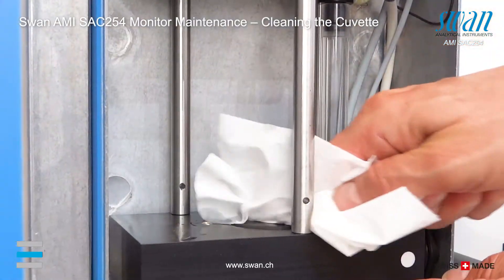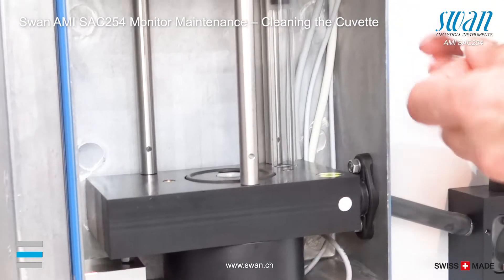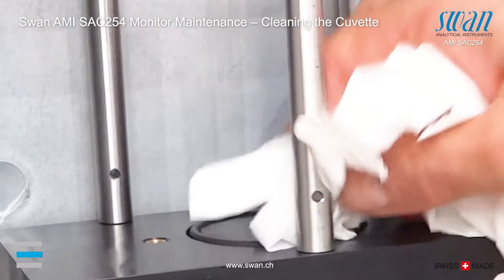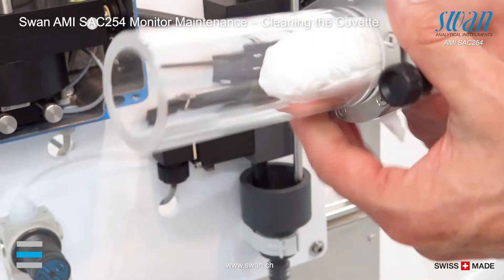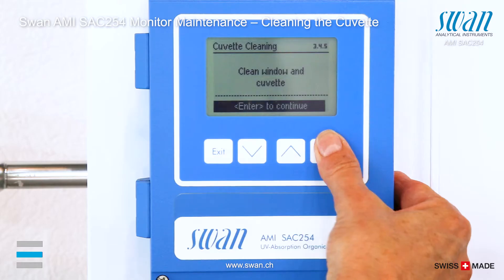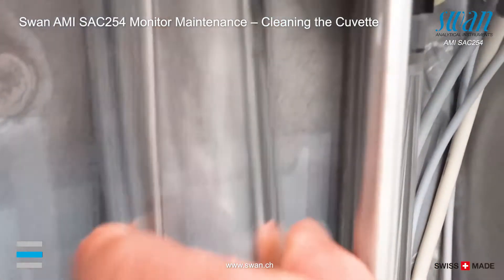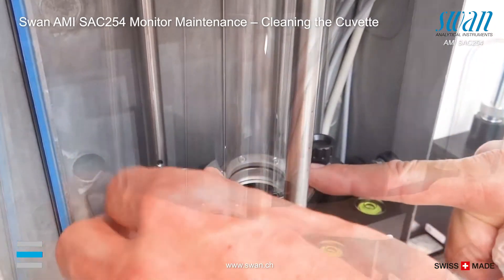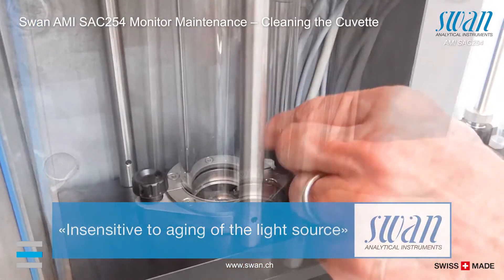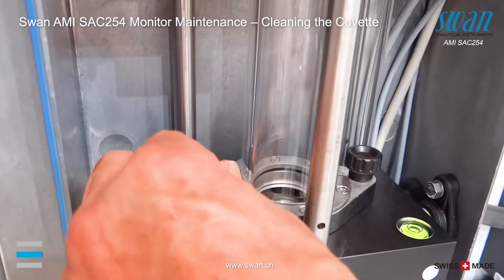Unscrew the knurled screws and pull the cuvette away from the base plate. Clean the slightly protruding quartz window. If necessary, clean the cuvette tube with a soft cloth.